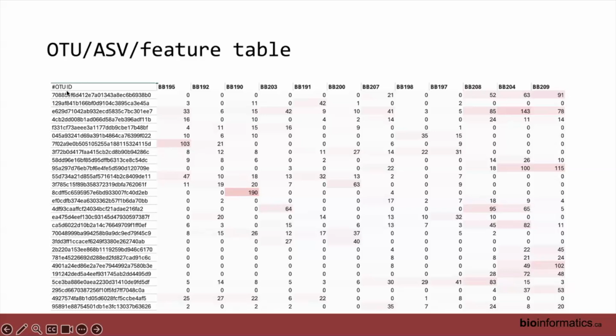Of course, this is what QIIME gives us as an output. Each of our ASVs is summarized with this MD5 sum. Anyone familiar with an MD5 sum, you often have it when you're downloading packages. It's a way of checking whether something is identical to something else, and there are programs that generate this for you.